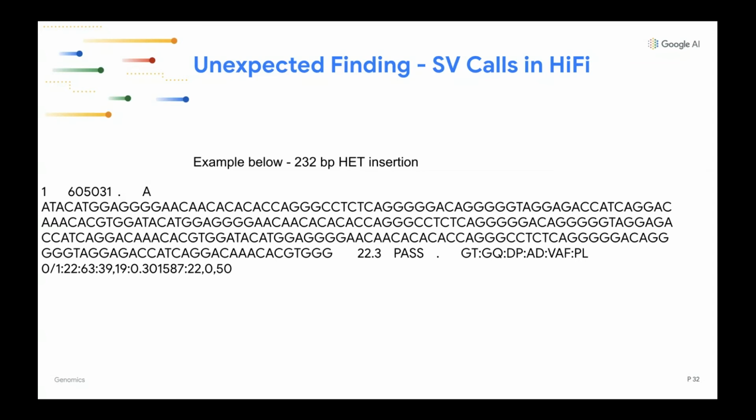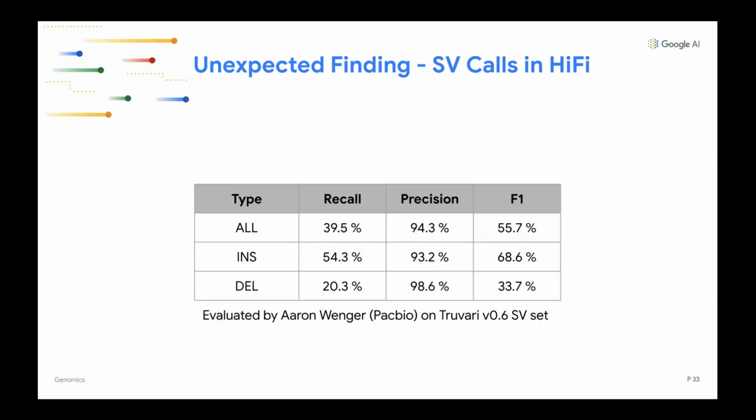So it's quite interesting that this behavior was able to be retained. It's shocking. So we're trying to investigate exactly how we can extend this functionality. Basically, I think what this means is that there are some generalized concepts which are important for indel calling, that it's more expensive for DeepVariant to unlearn and gain the accuracy of not calling structural variants on that truth set than it is to retain. So that's an interesting observation.